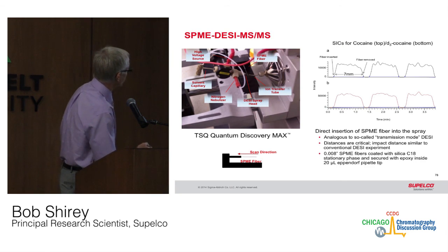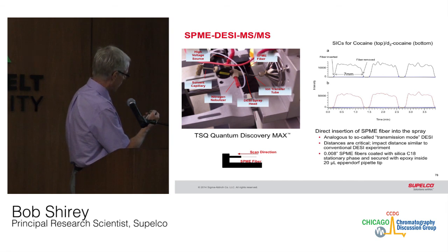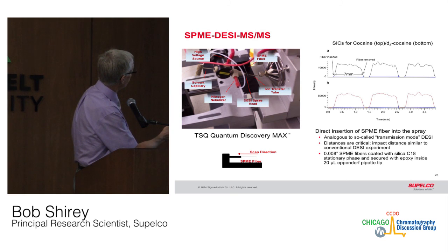And how was this done? This wasn't done by solvent desorption. The fibers after extraction were put into a direct interface with an MS-MS. As you can see, the fibers were mounted, and then the nebulized electrospray was sprayed over the fiber, and the ions then go directly into the mass spec.